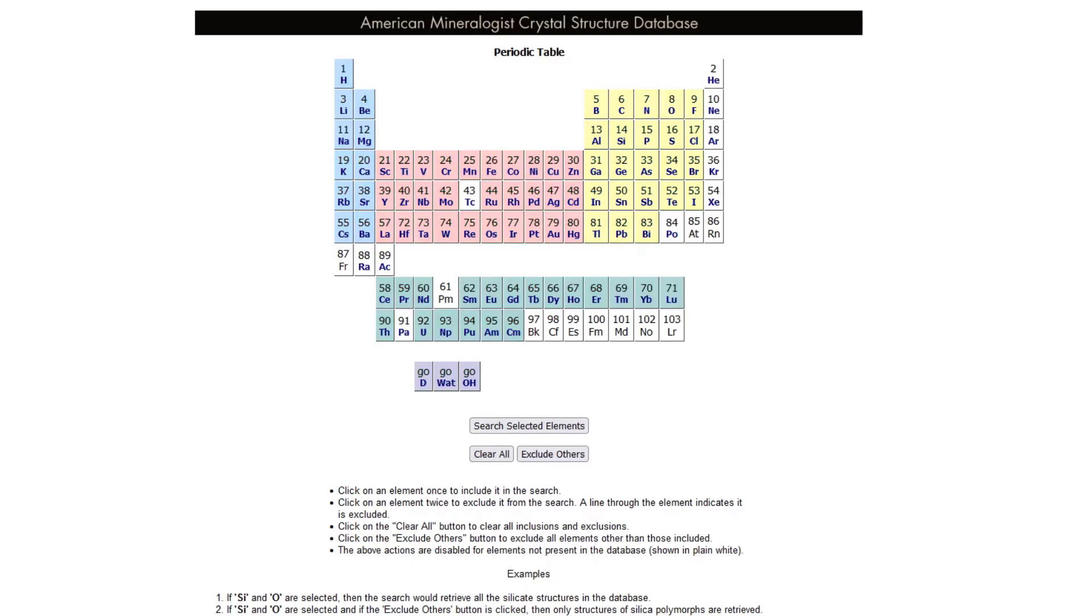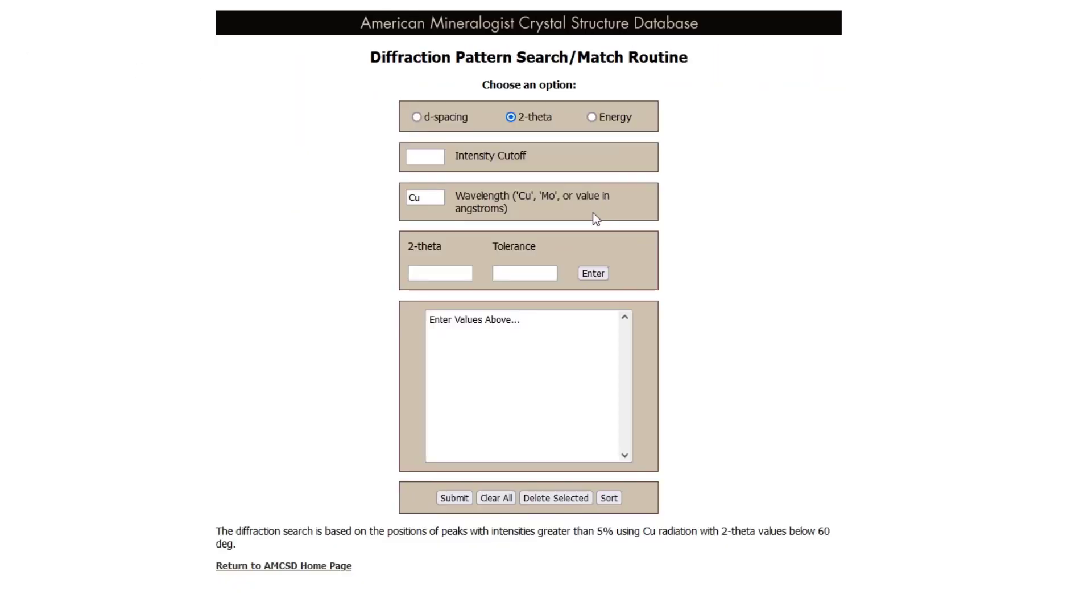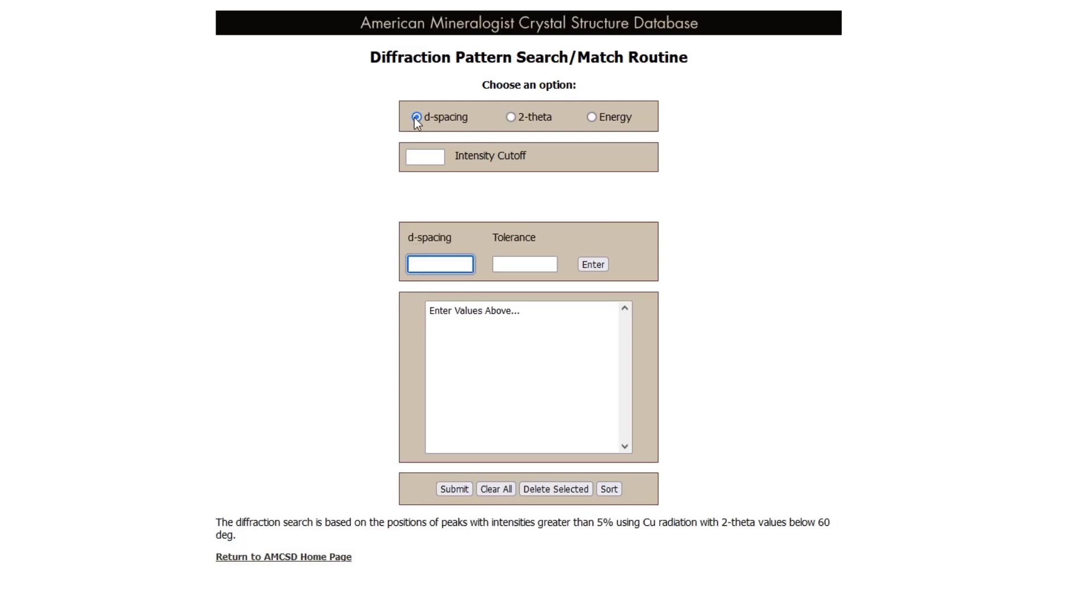Alternatively, we can use the D spacings that we measure and do a diffraction search. We select D spacing, we type in the values, and then the tolerance is plus or minus some value that you're willing to let the system accept. If you really have no idea what your phase could be, this is a good option.